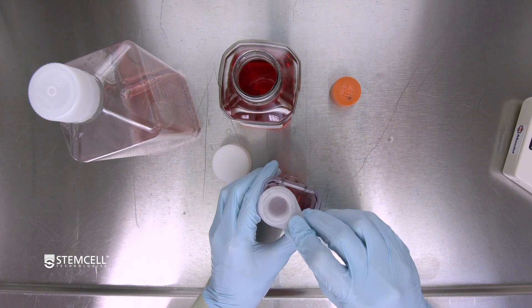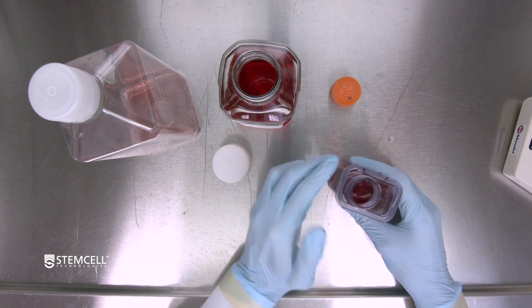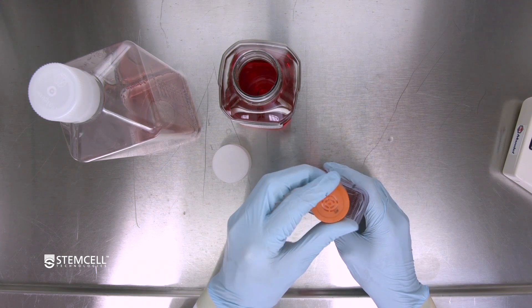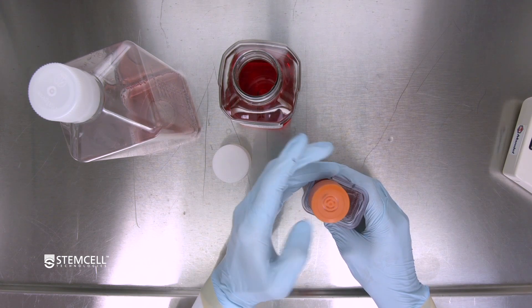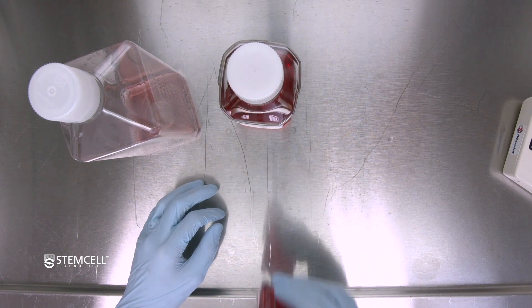Once finished, remove the filter and return the cap of the bioreactor vessel. The bioreactor can then be returned to the incubator.